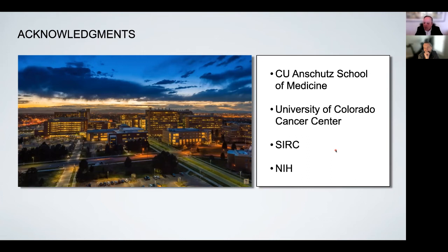And that typically is done non-specifically with a very, very low concentration of, for example, glutaraldehyde cross-linking, or it can also be done with the types of cross-linkers that are used for cross-linking mass spec. So yeah, either one of those approaches could be used to stabilize a complex before looking at it by CryoEM.